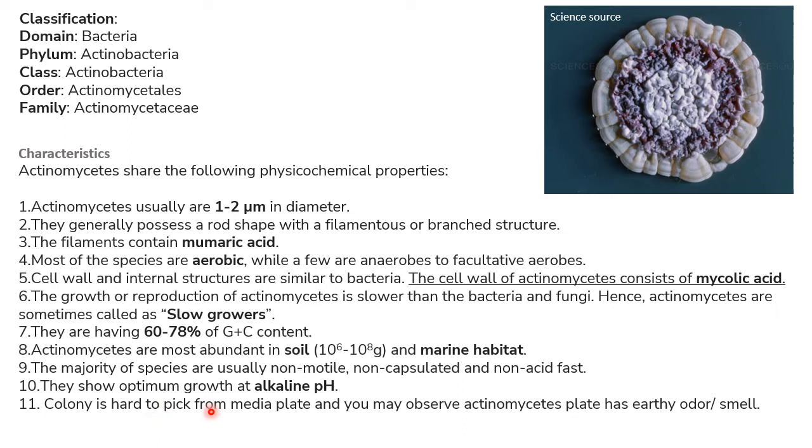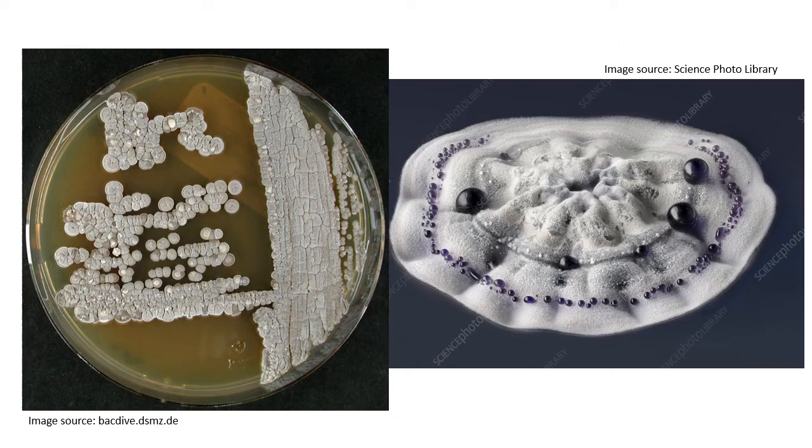Colony is hard to pick from the media plate, and you may observe the Actinomycetes plate has an earthy odor or smell. When you are trying to isolate, you can just try to smell your plate from outside without opening it. Okay, so you may find a little bit of that earthy odor or smell.